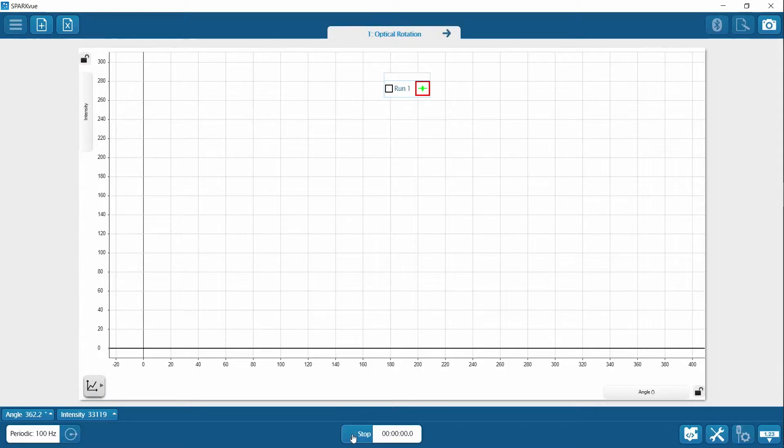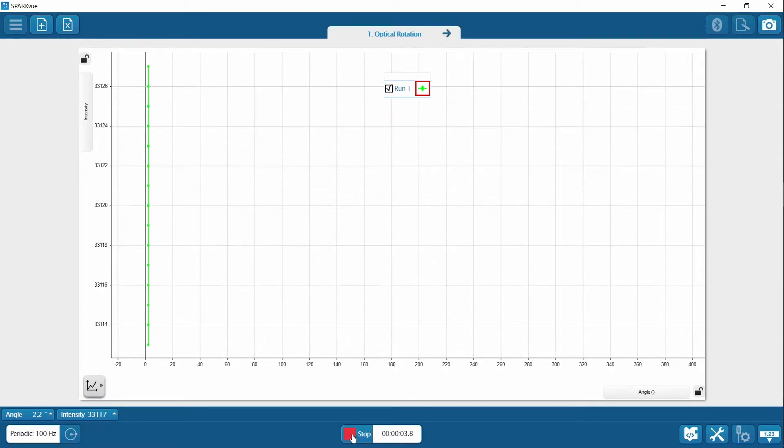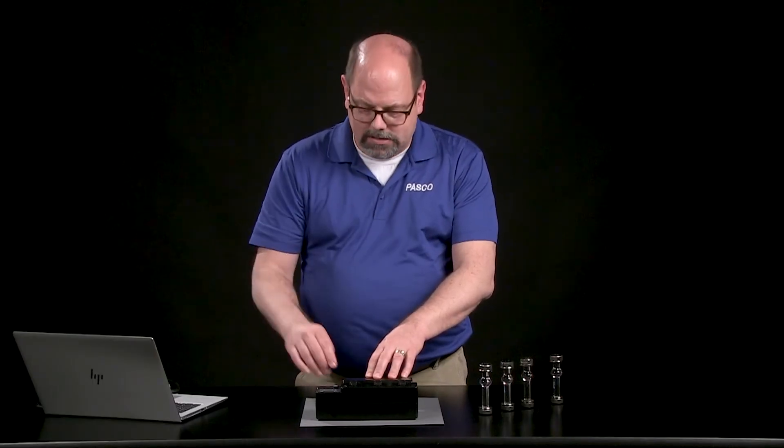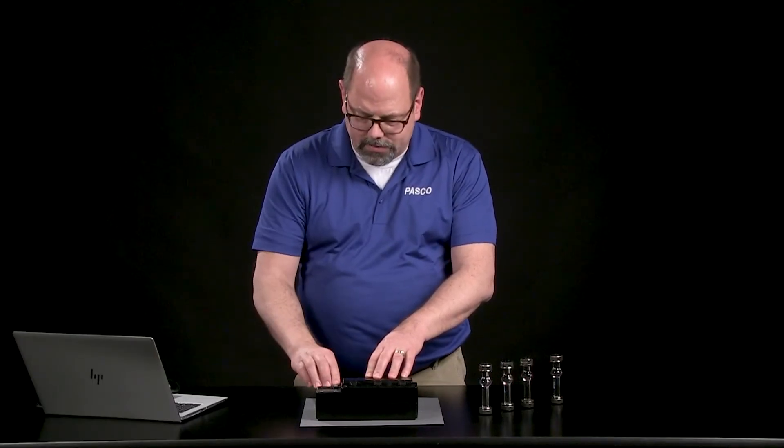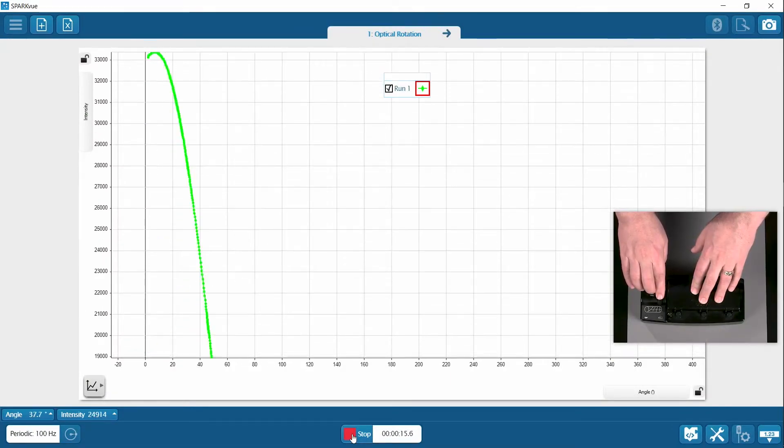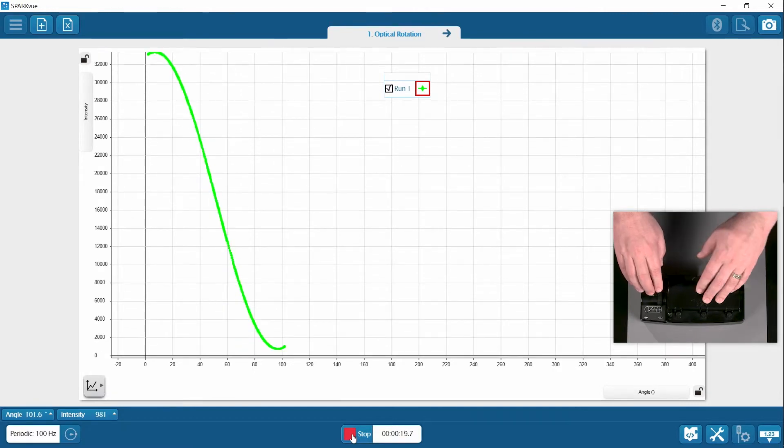I've marked this just so you can see it. Let me turn this on. You'll see I'm starting really close to the axis. When you turn this on, that's going to be determining where the axis is. It could be in any position, but ideally you're going to start there. If I start to push this forward, notice that there's a peak and down at the bottom there's a minimum. Now we're at that minimum—the polarizer on this side is like that, the polarizer on this side is like this, so any light making it through this one does not make it through the second one.